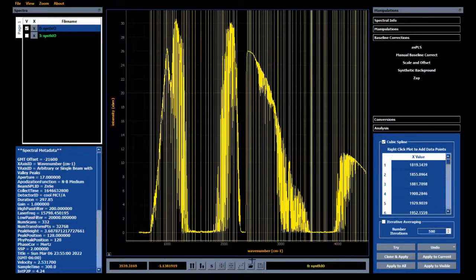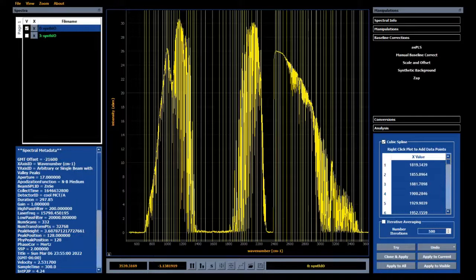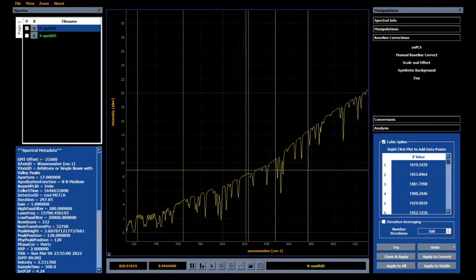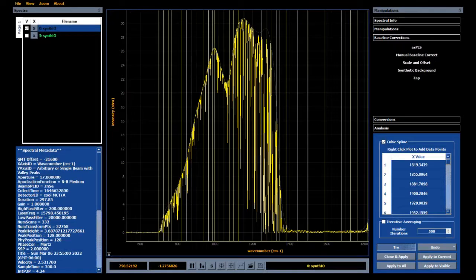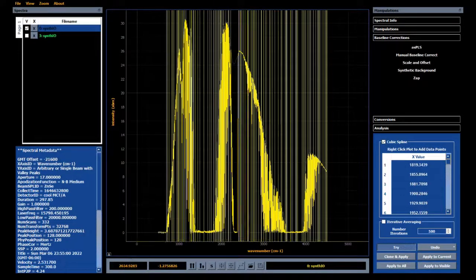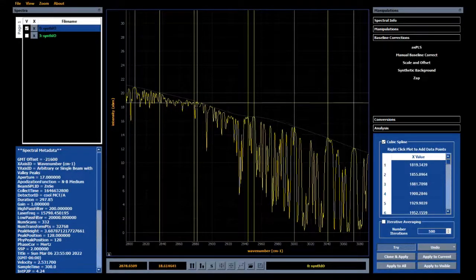This is the cubic spline. To save time, I've already set all my knots. You basically would right click in regions in which there is no absorption. Let's try. And you'll see that those will create these knots, and this is more of a manual technique. It takes time, it's very tedious, but you can really get in there and get it exactly how you want it.